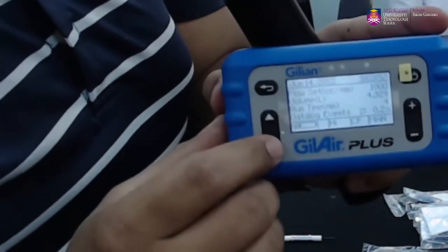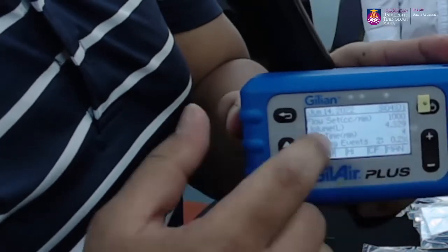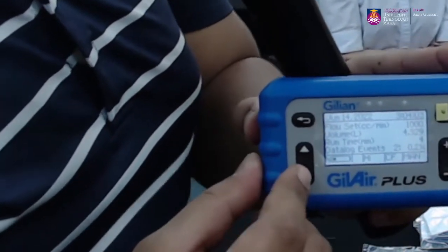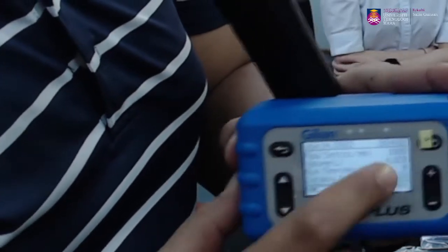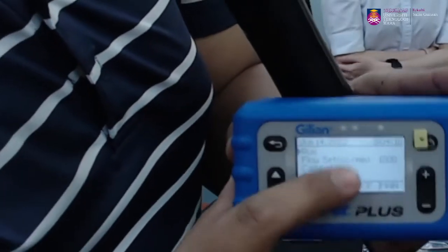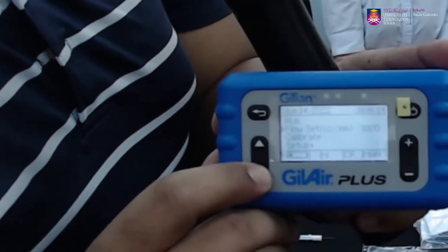Okay. So daripada sini kalau kita nak setkan flow rate, this is the main screen. Dia tunjukkan kita last sampling yang kita ambil. So kalau contohnya kita nak check balik in terms of setting kita, kita tekan enter. Kita set pada 1000, nak tukar kepada 2000. Okay, kita setkan kepada 2000.